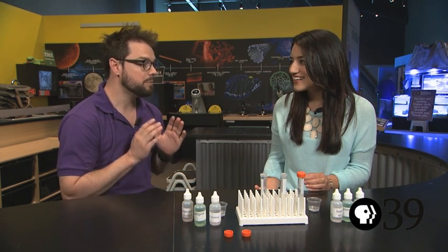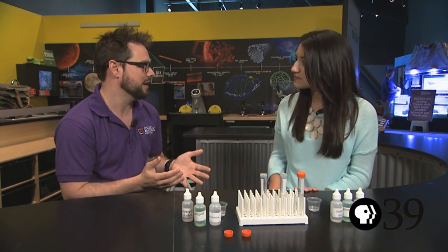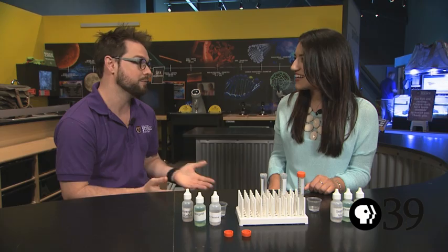So Jonathan, we know that in order to see our cells, we have to look through a microscope. But is there a way for us to actually see our DNA? The problem with DNA is it's even smaller than our cells. So even with a microscope, we can't see a strand of DNA. But luckily, there is so much of it in our body and in our cells. If we get enough of it together, we should be able to see it even without a microscope.